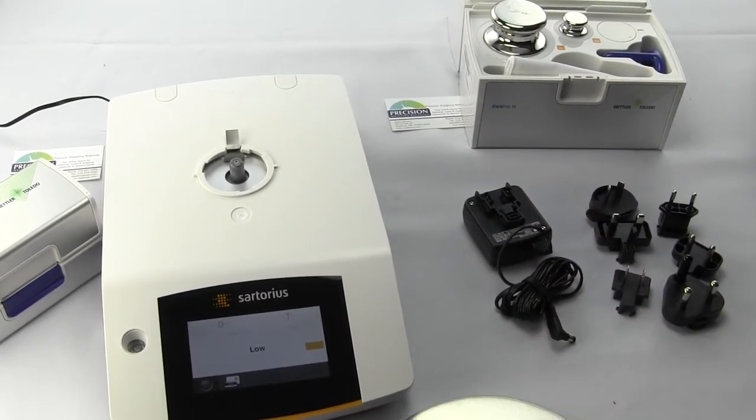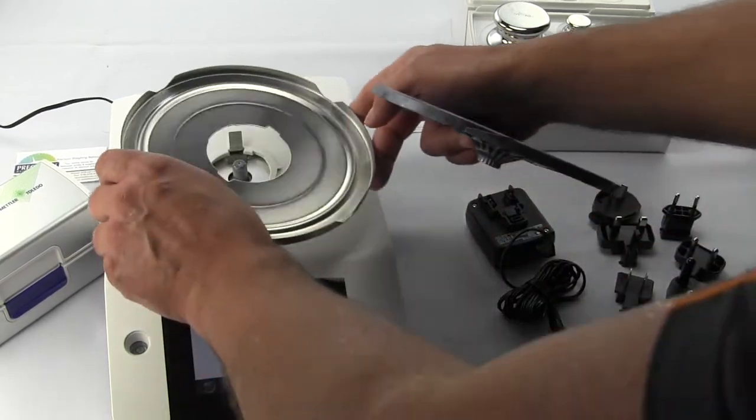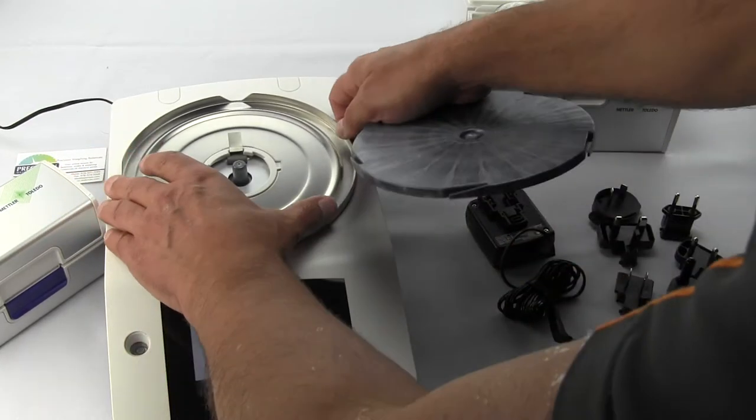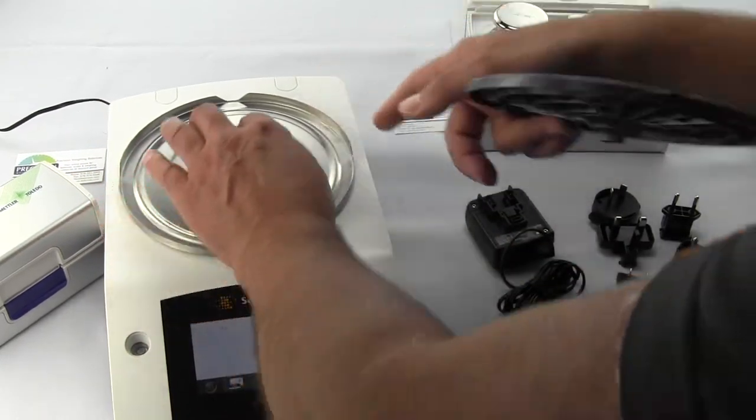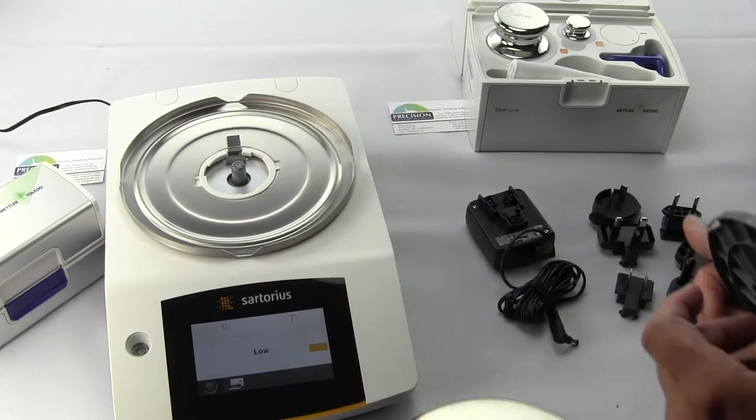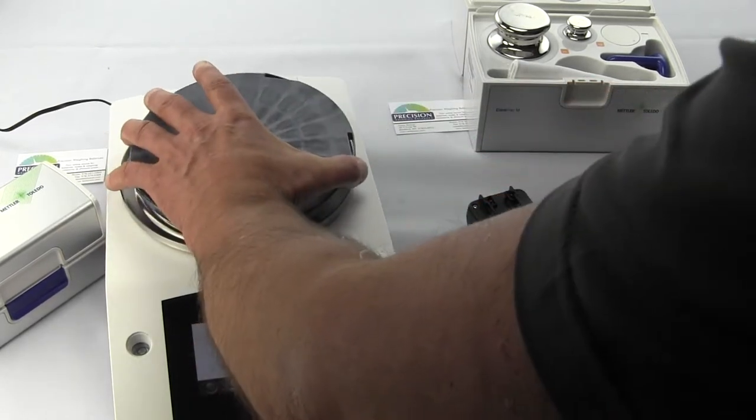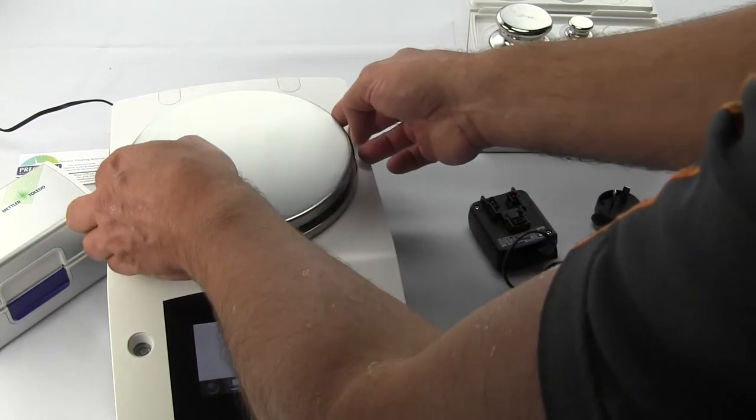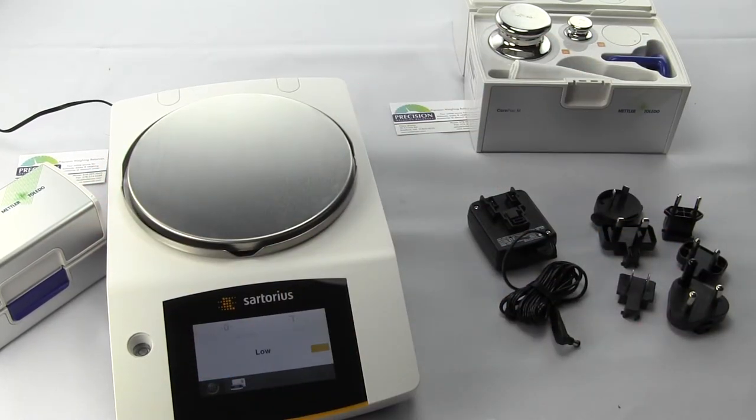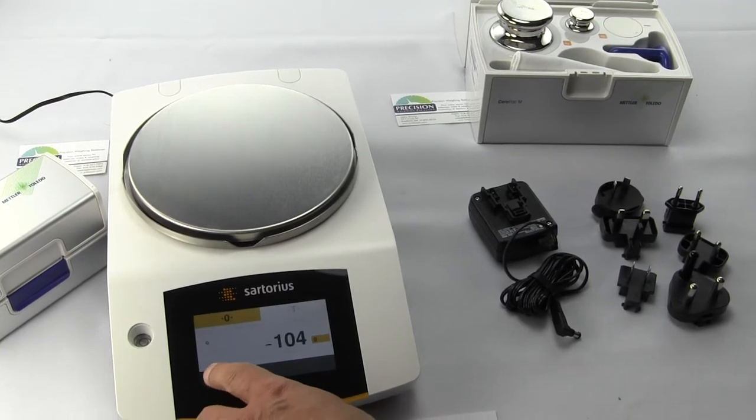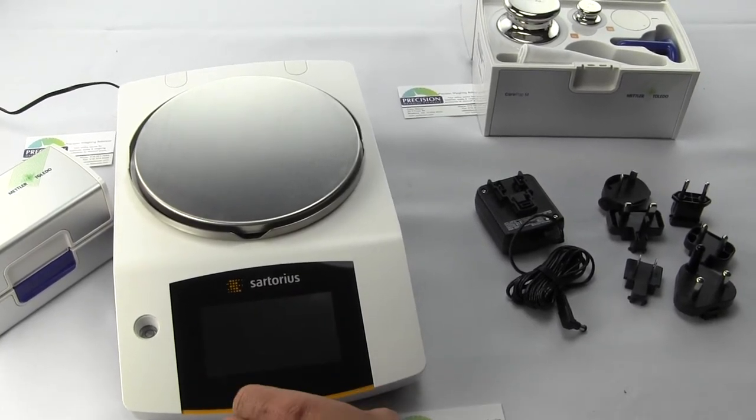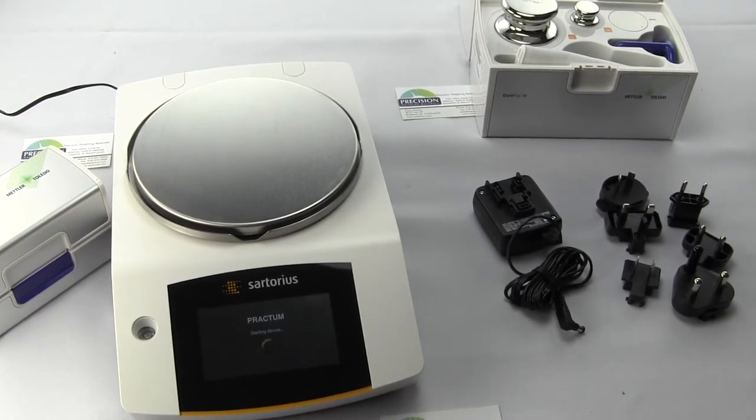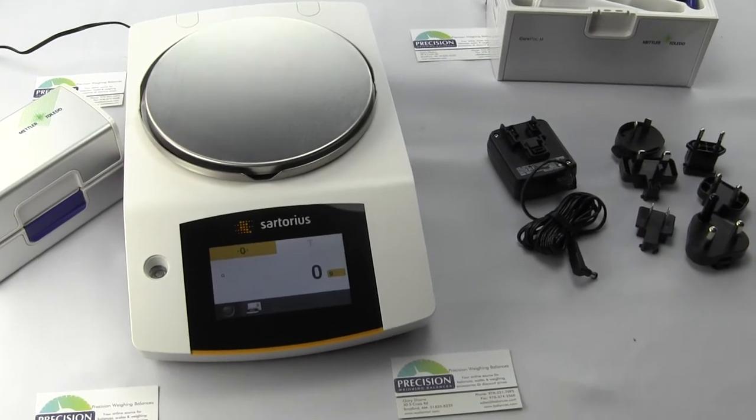When you install your balance, you put on the spill guard—that tab goes down to ground it—then the European support for your balance, then your stainless steel platform. You'd have to reset your balance. We'll power it down, power it back up, and you can see the Practum does its power up sequence and you're back to zero.